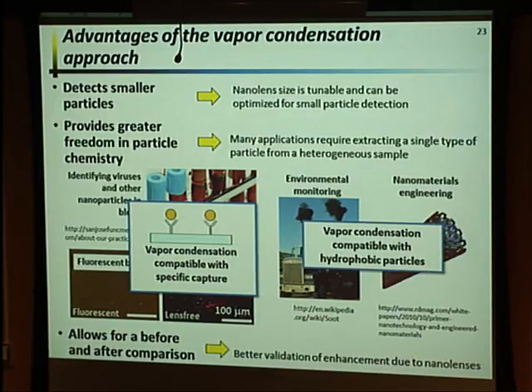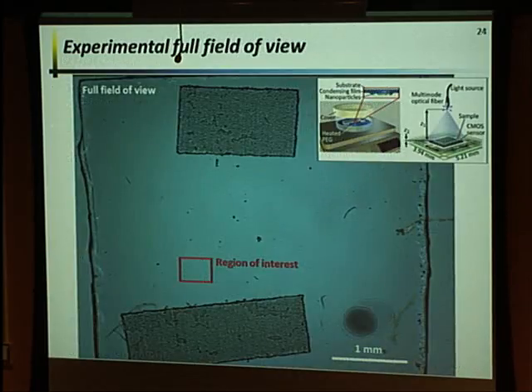And then the last is that we're actually able to do a before and after comparison of exactly the same field of view so that we can get a very quantitative assessment of the enhancement due to these nanolenses. So this is a typical sort of experimental result.